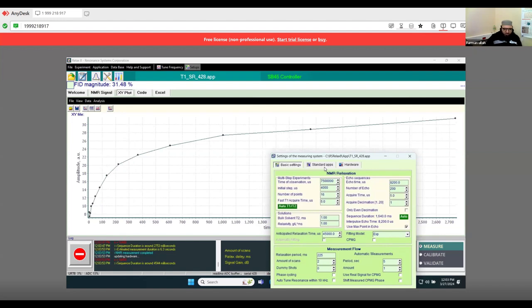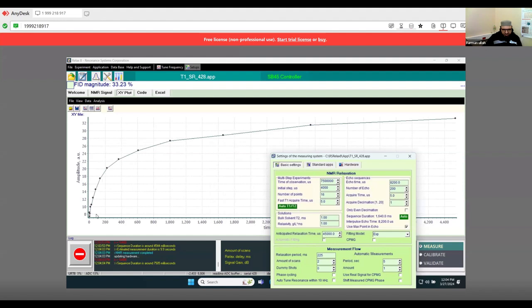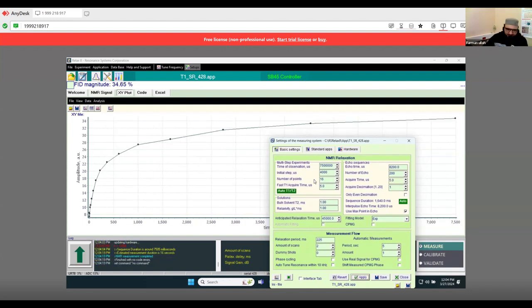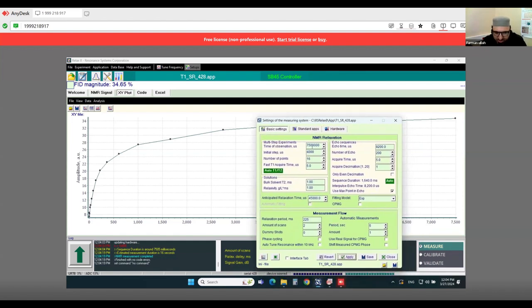So one thing you people see here, this is machine error. This is the first point which is not in the patterns. So we do not see that when we are plotting the origin, you will see there what actually happened to the sum. Very long observation time for this sample.